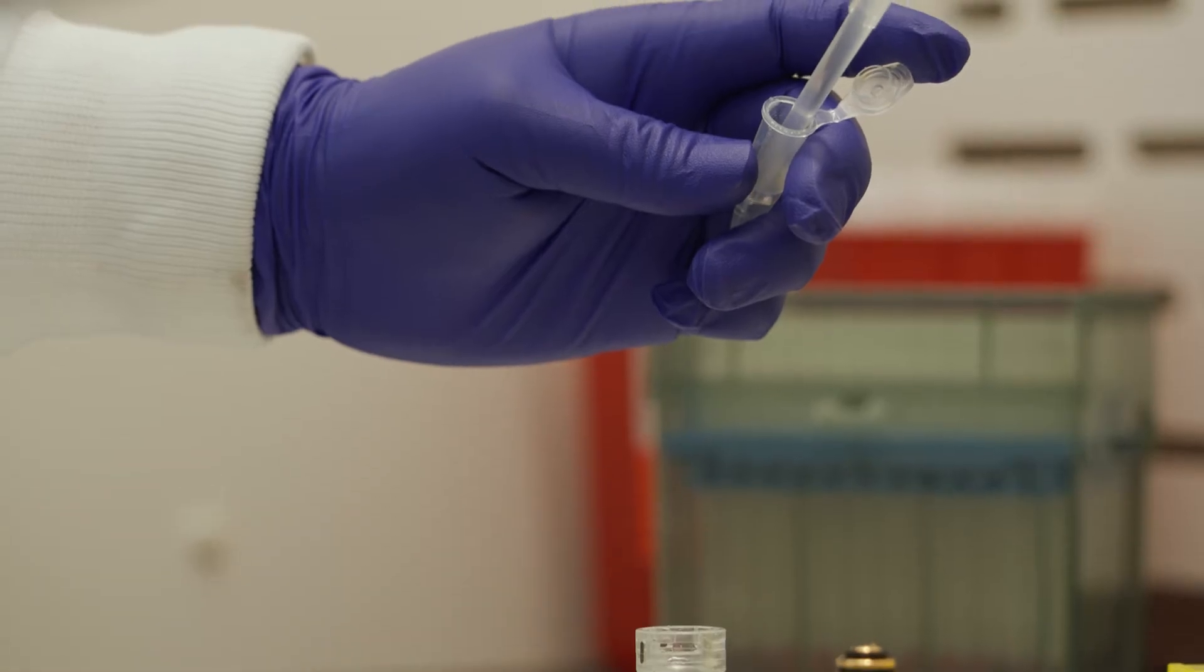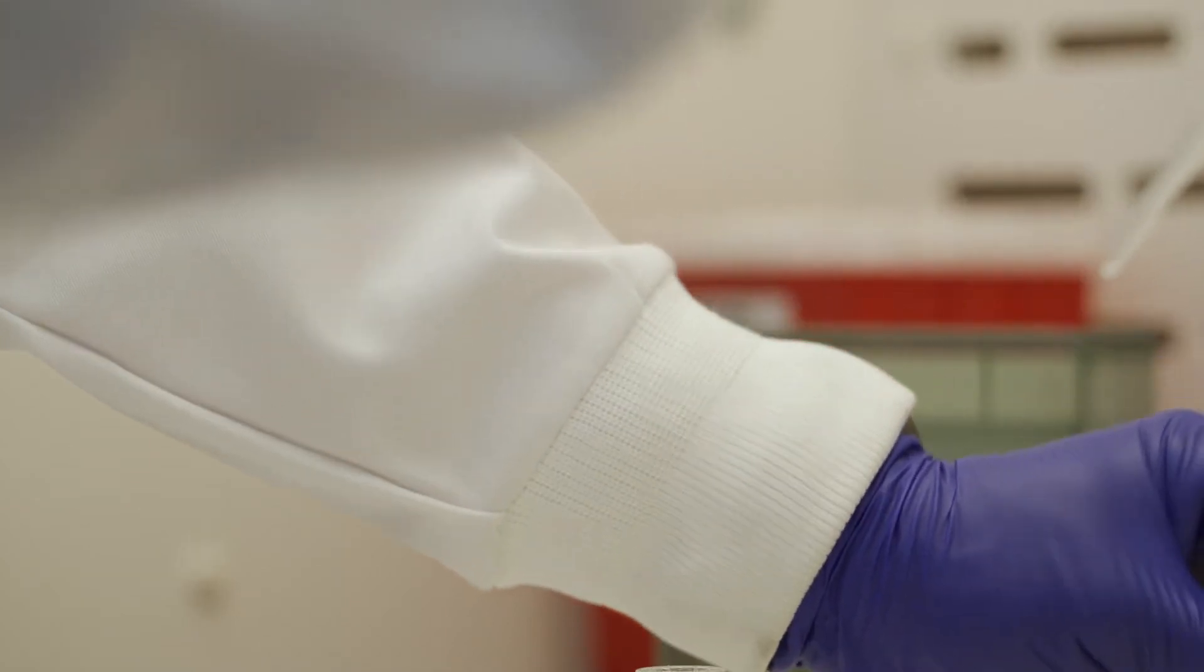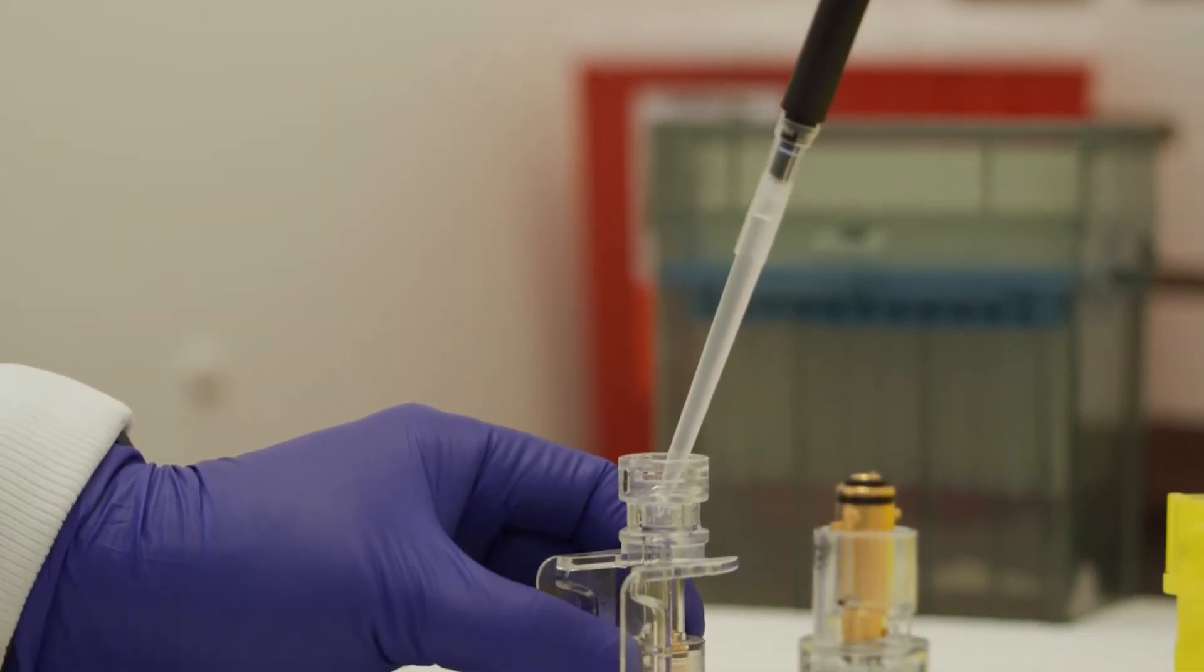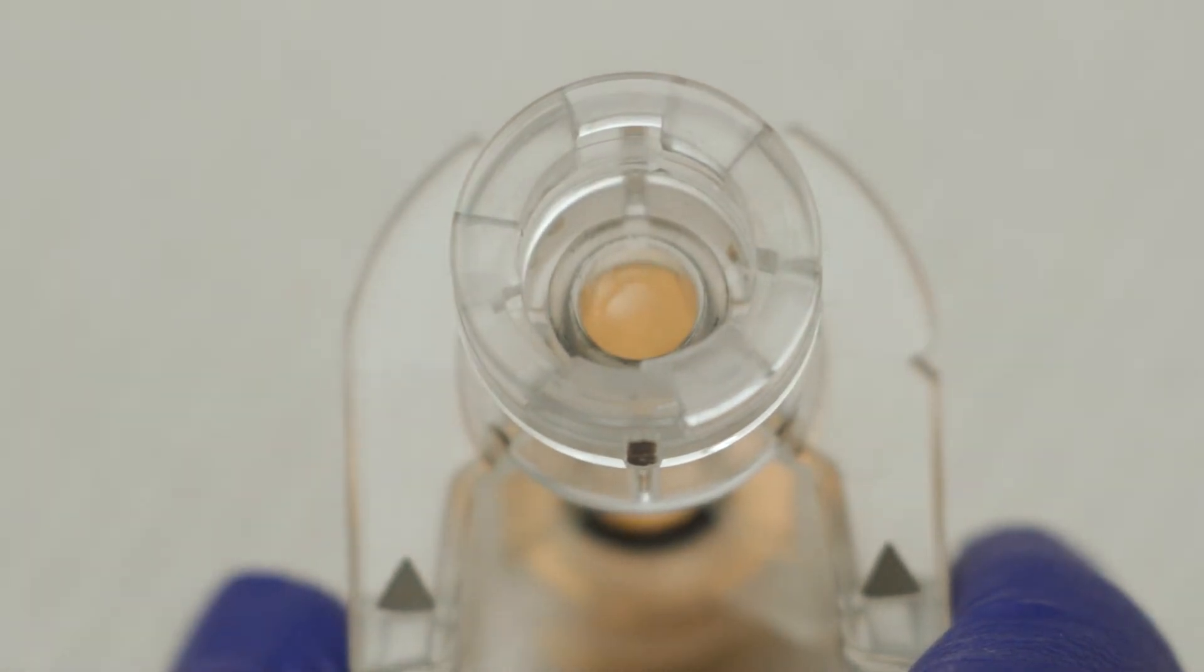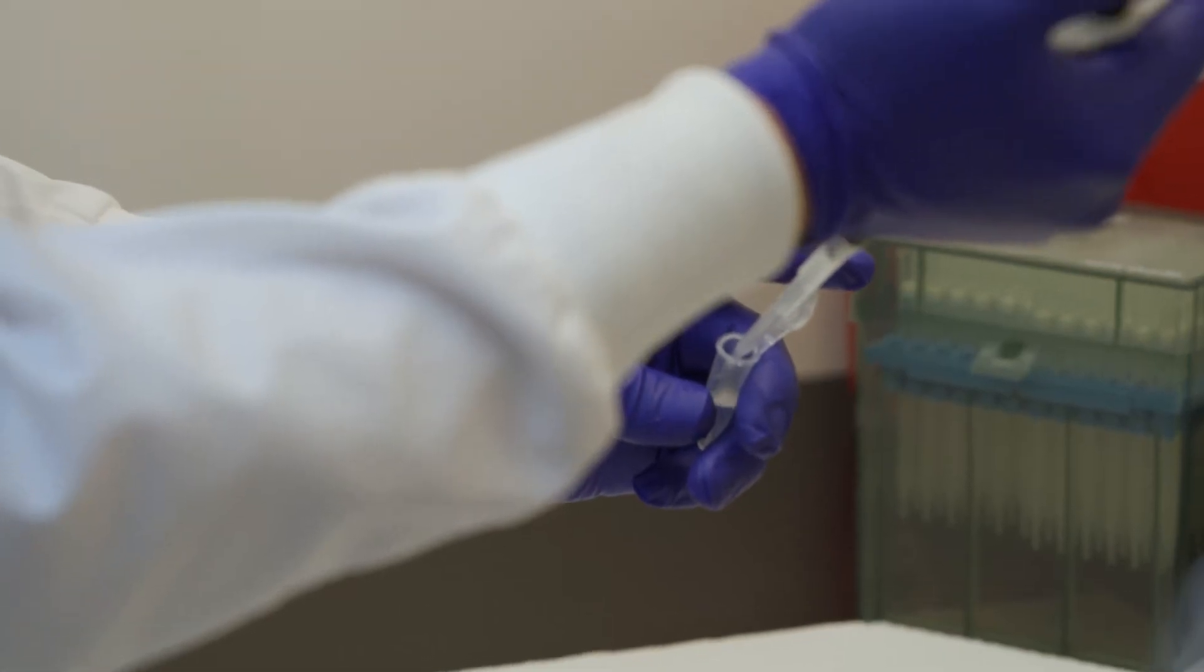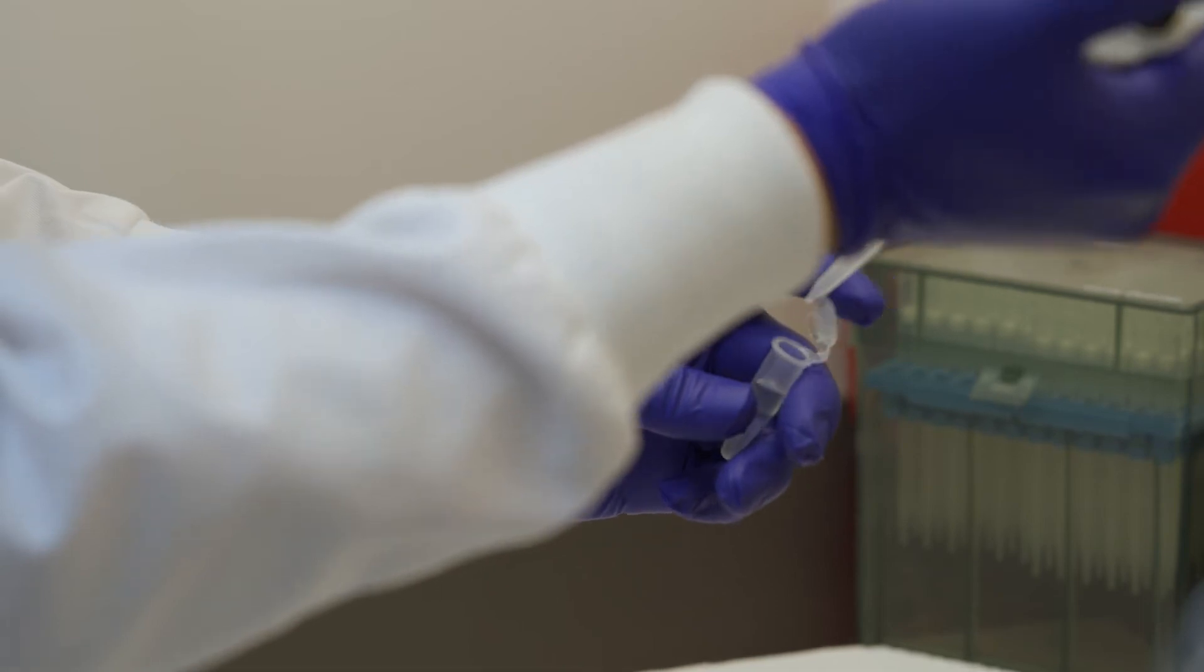First, fill the single shot chamber with approximately 1 milliliter of cell suspension by placing the tip of the pipette at the bottom of the chamber and filling from the bottom up to avoid bubble formation. The liquid should form a convex meniscus at the lip of the chamber. If additional volume is needed, use a P20 or smaller pipette.